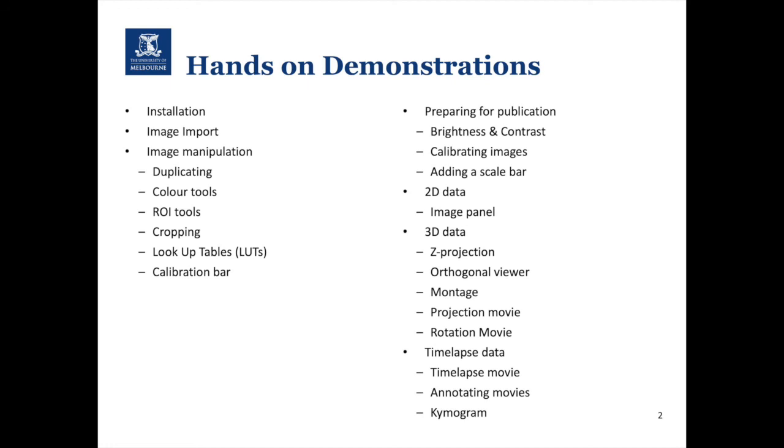We now have free time for you guys to go through and try all the activities that we've covered. You will find those in the hands-on session PDF that you should have downloaded along with the demo data. As mentioned before, we have multiple members of our team online waiting to answer your questions. If you have any, please use the chat box to raise if you're having any problems, and I'll set you up in a one-on-one breakout room with a member of the team who can hopefully resolve any problems that you're having.